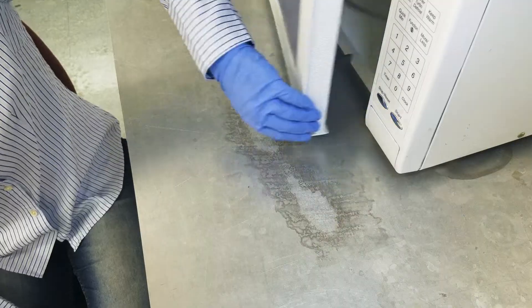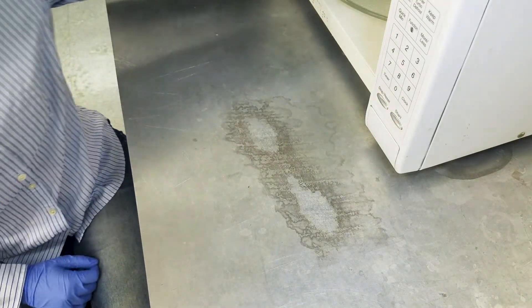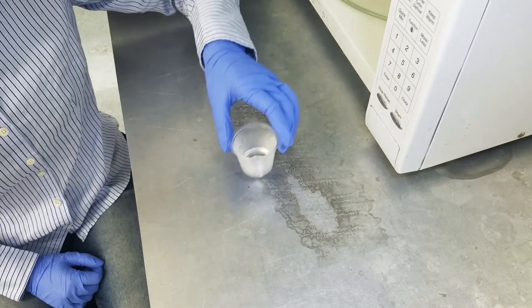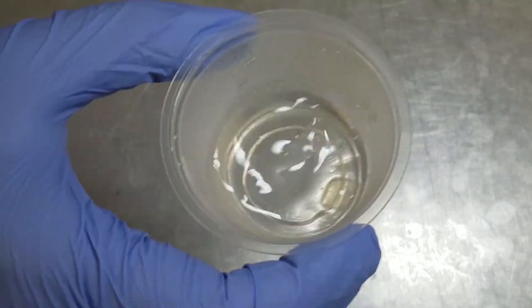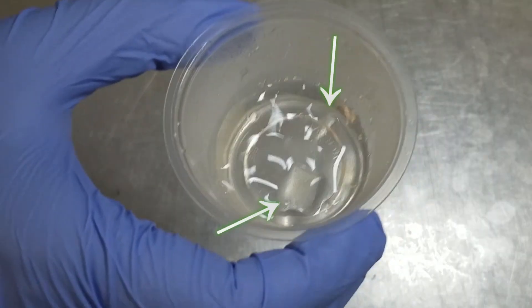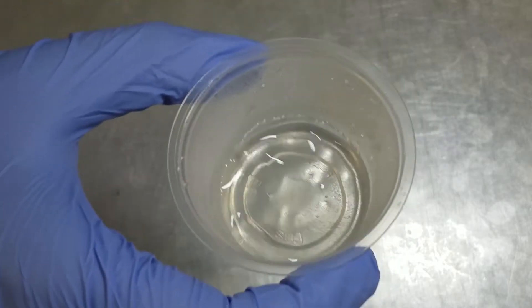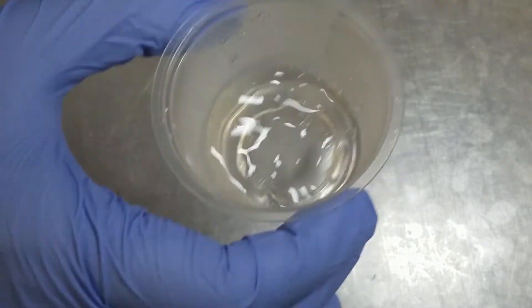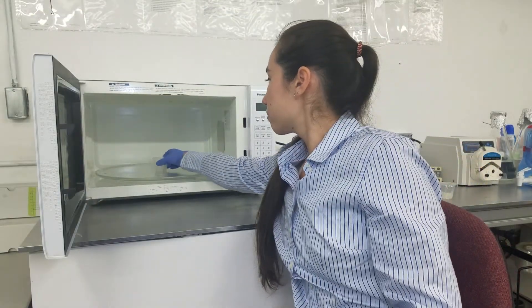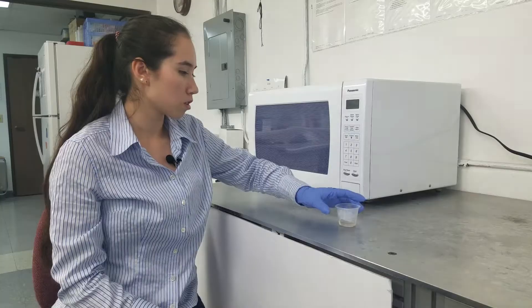Now we're going to check on our gel cup. Take out the cup and swirl while checking for any unmelted pieces of agarose. Look carefully as they can be transparent. If there are any small chunks, put the gel cup back into the microwave for another 5 seconds. Swirl and check again.